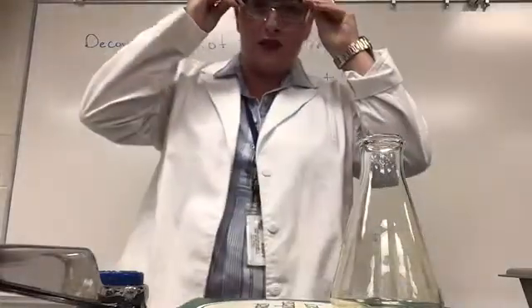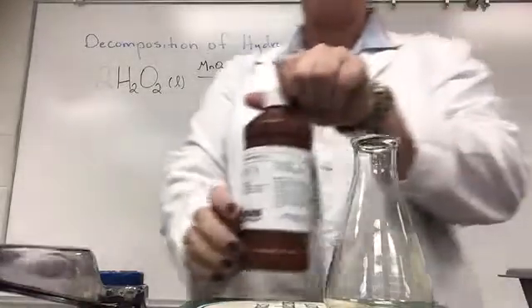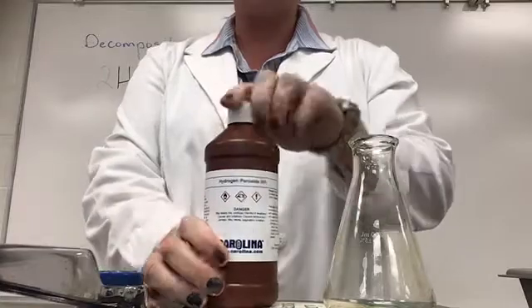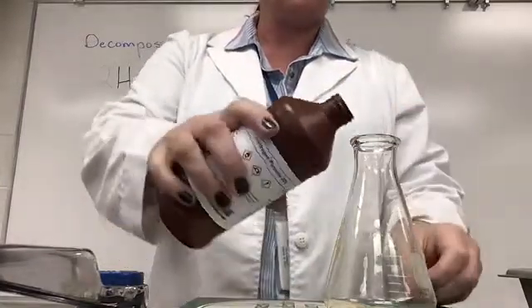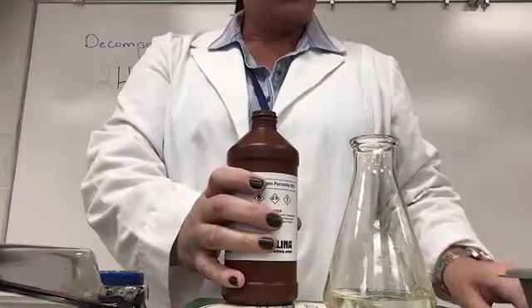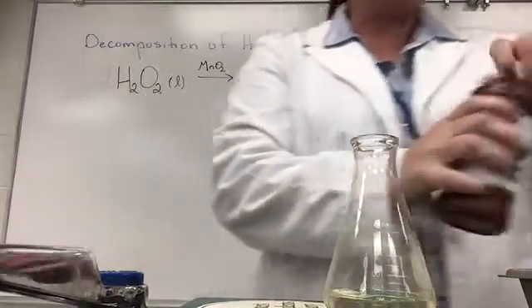Alrighty, let's get started. In my Erlenmeyer flask here, I'm going to add some hydrogen peroxide, and this is 30% hydrogen peroxide. This is a little bit more concentrated than what you would buy in your regular pharmacy. Usually it's 3%, but this comes from a specialty store.